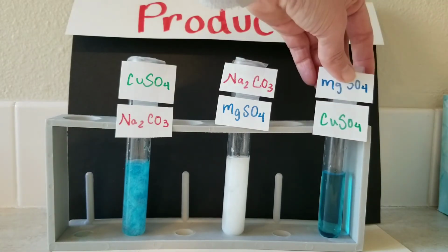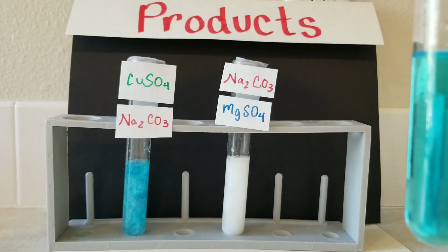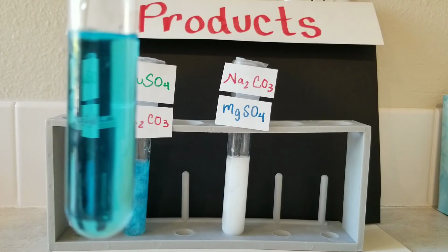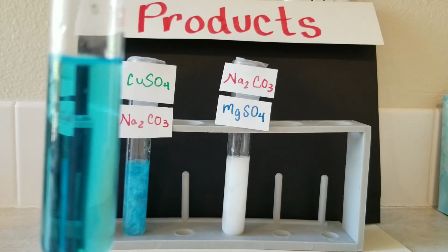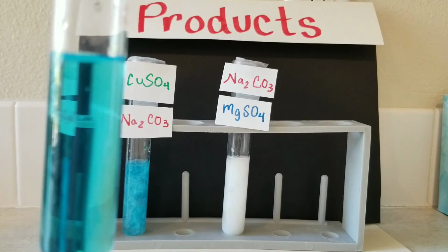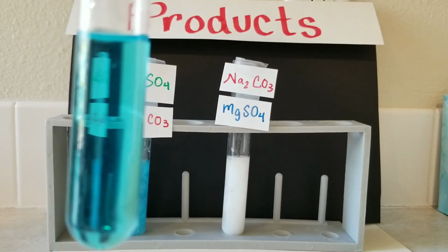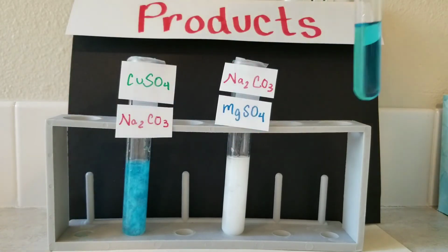So I'm just going to hold each one closer so you can get a better idea of what it looks like if I can find the camera. So this is our first one here, the combination of the copper sulfate and the magnesium sulfate. You can see it's really blue, but it's clear, not different than what we started with.